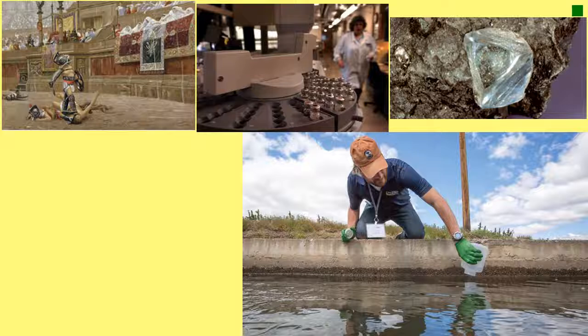Also, what we have here is a diamond. Using a mass spectrometer, you can work out exactly where in the world the diamond comes from, and that aids or leads to the identification of the illegal trade in diamonds. What's more, water samples are routinely taken and analysed for organic substances that shouldn't be in our drinking water.